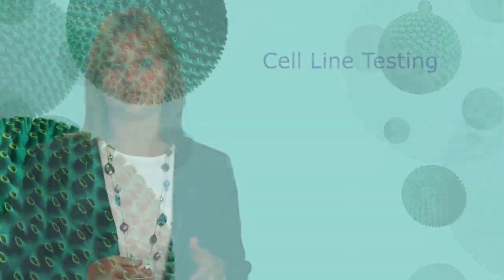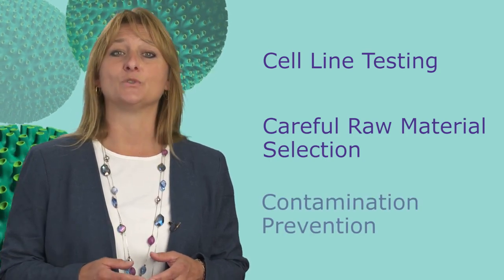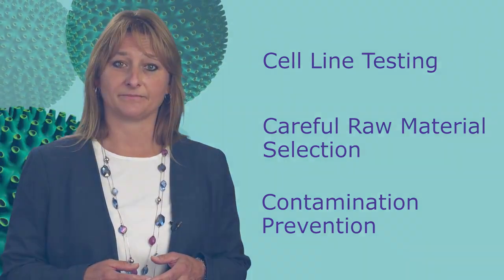The best way to mitigate contamination risk: test your cell line, understand and carefully select your raw materials, and use appropriate methods to prevent introducing a contamination.